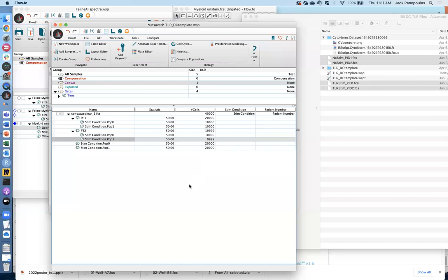Okay, the next question. The normalization seminar skimmed over the necessary controls. What type of controls are required for cytonorm? We're using a tumor that expresses varied amount of antigen. So finding a control that consistently expresses all the markers has been difficult.